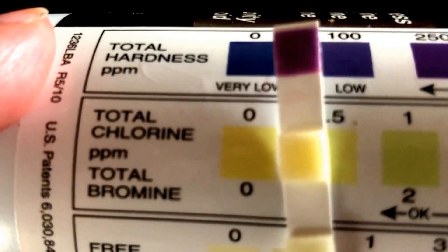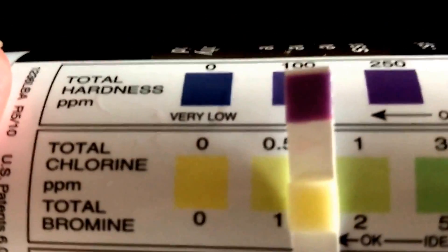The second metric is for total chlorine. My total chlorine is not too good — it's probably about here, somewhere around here. So I would need more chlorine added to the pool.